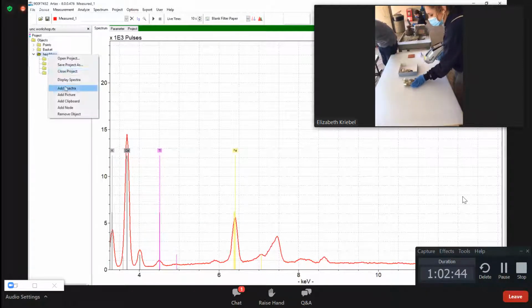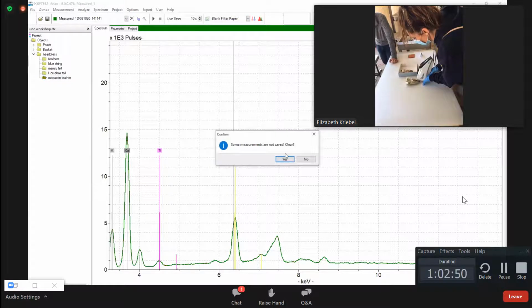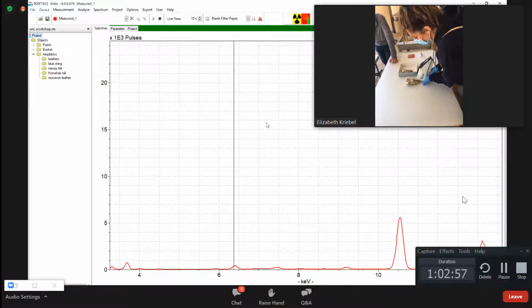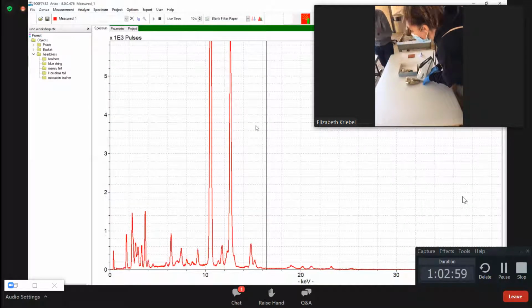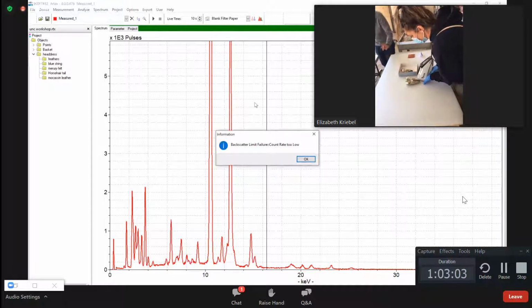I'm going to add this on, add spectra. Ready when you are. All right, starting. Yeah, this is just lead. Oh, just lead. Yeah. All right. Sorry, real quick.